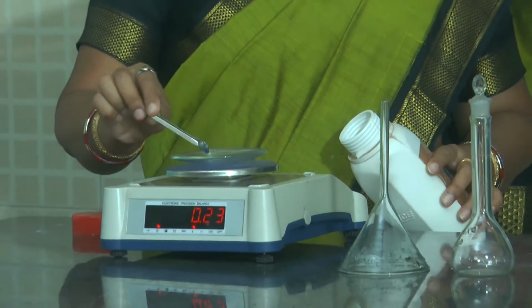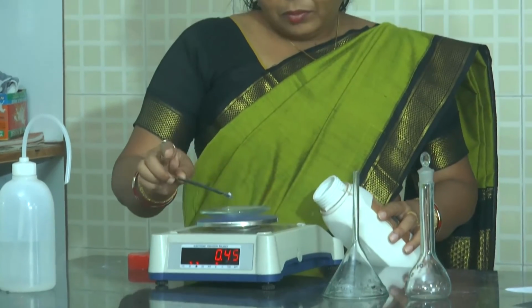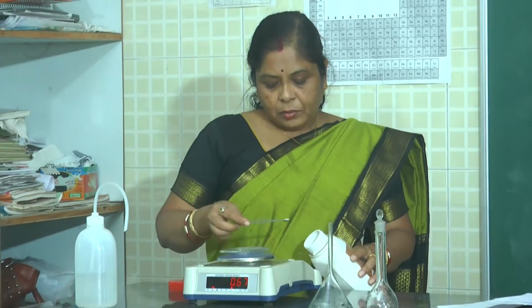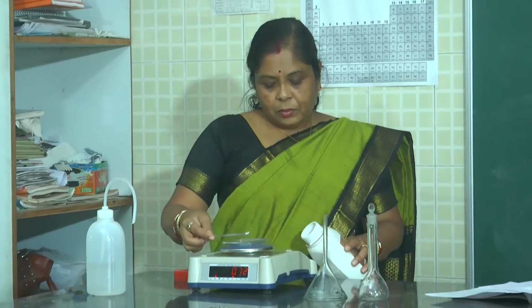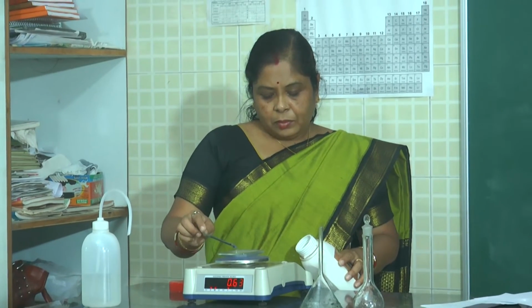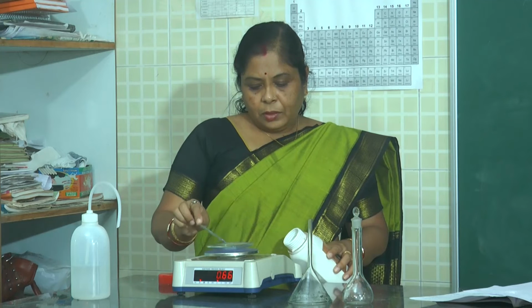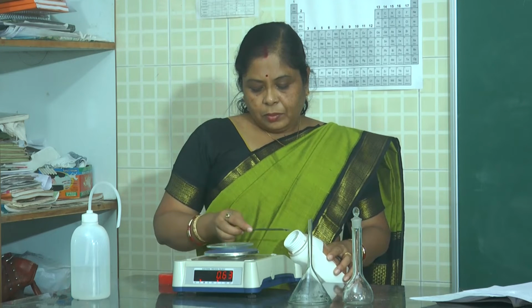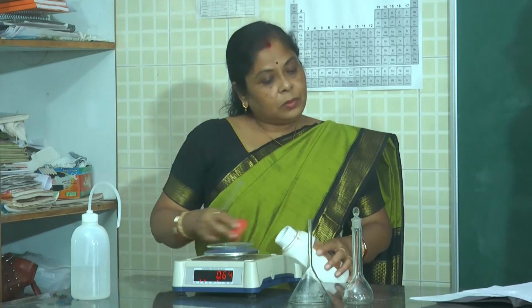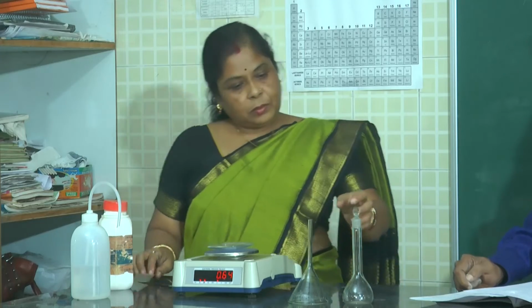Let us take 0.63 gram of oxalic acid dihydrate. Remember that weight must be correctly taken. Your standard solution must have a definite quantity of weight in a definite volume of solution. Gram equivalent per liter of solution. Similarly, gram equivalent in this case in 100 milliliter solution. So this is your 0.63 gram of oxalic acid.